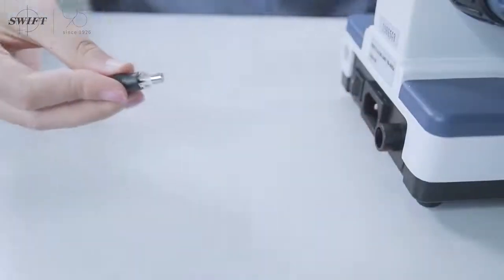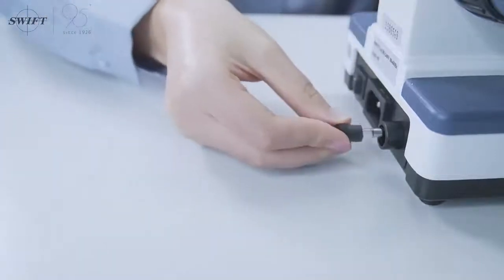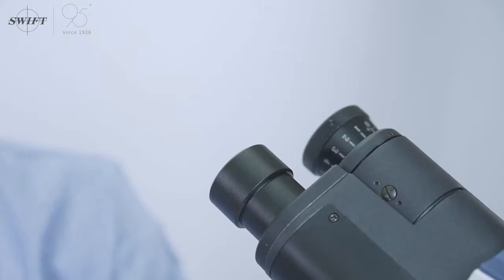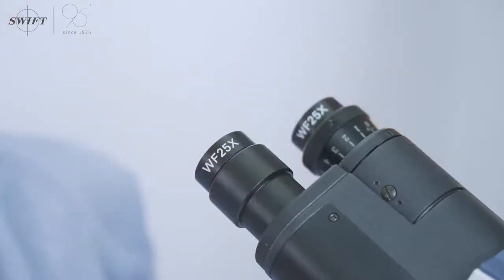The external fuse of this model is easy to install and replace. The eyepiece is equipped with 10x and 25x specifications, which is convenient for different users to choose.